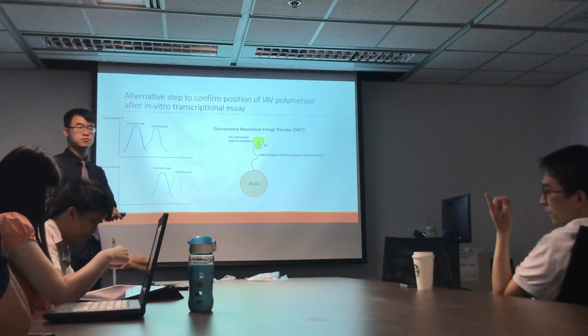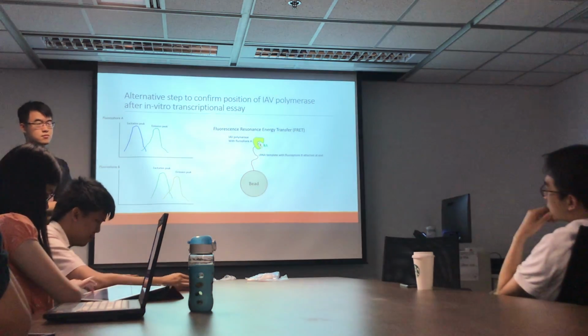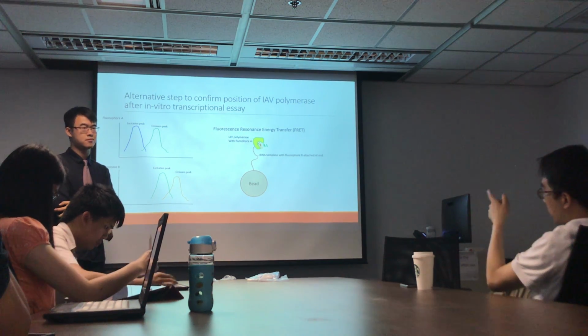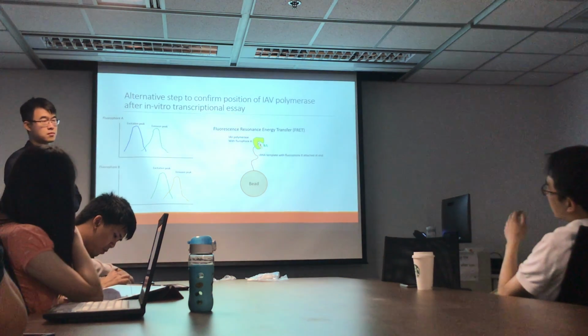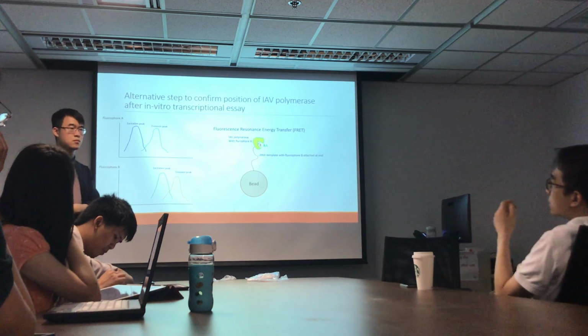So you're talking about stop flow, right? Yeah. I don't think this device can do this, borrowing this idea. A real stop flow needs a special pump that needs high pressure, and the detector. I think they have this stop flow machine, like a separate machine.